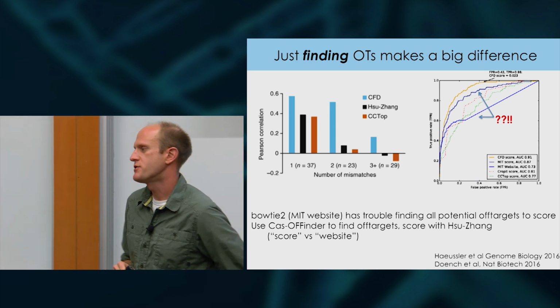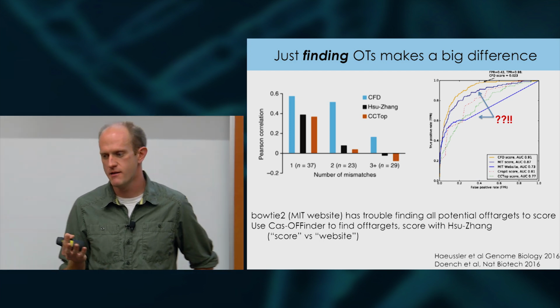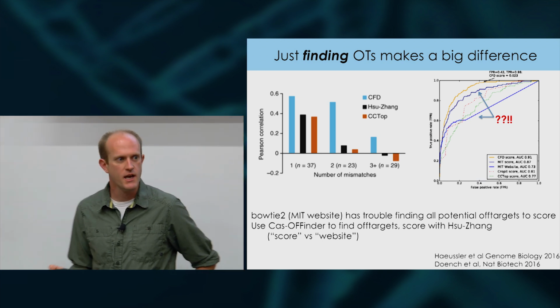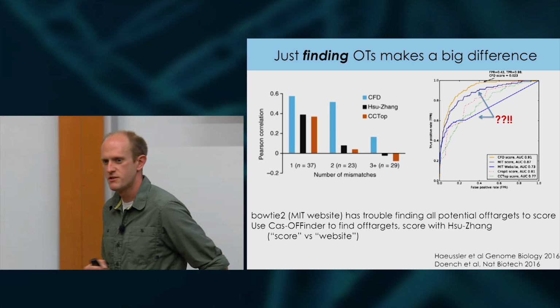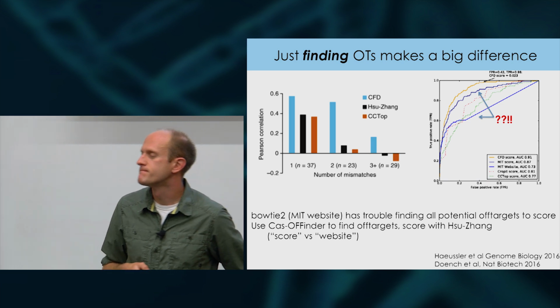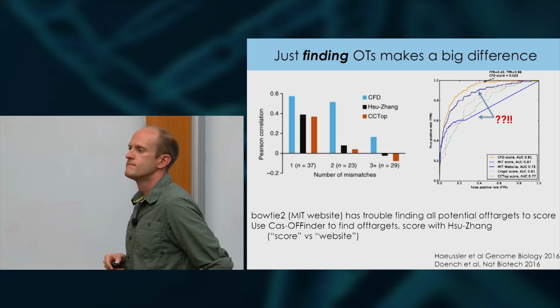Absolutely true. A lot of these programs have a lot of command line parameters. You have to tweak these things, and the parameters you might use for, say, short read alignment for sequencing might be different than what you might use for a 20mer. So we shouldn't be surprised that you might get underperformance if you just try to use it straight out of the box. You say this Cas-Off Finder is really slow because I think it's not feasible to do for full libraries of off targets.